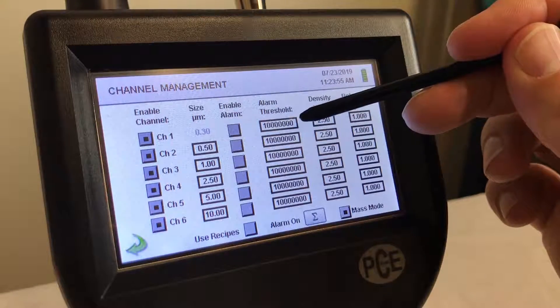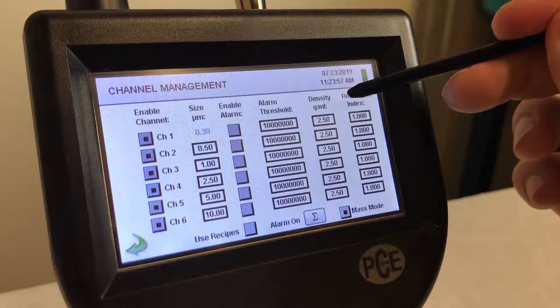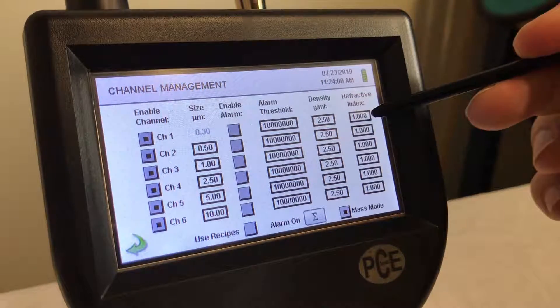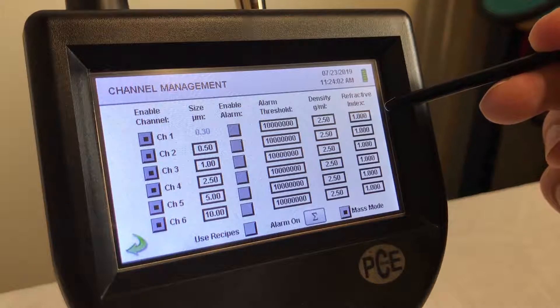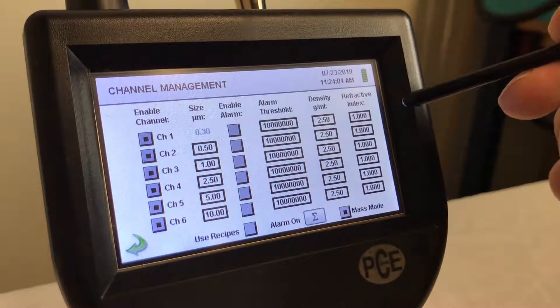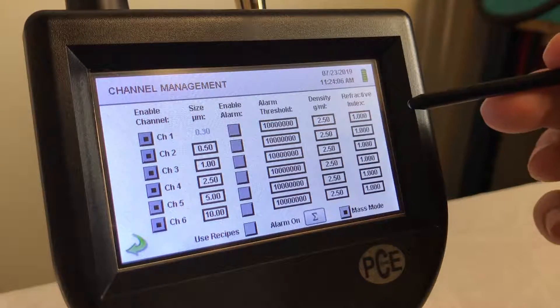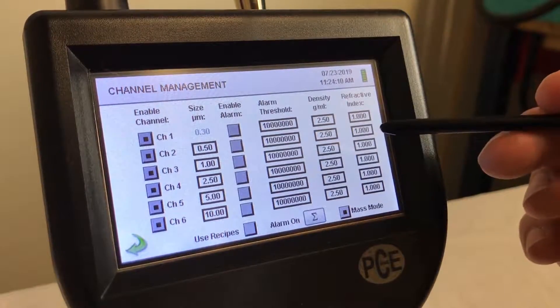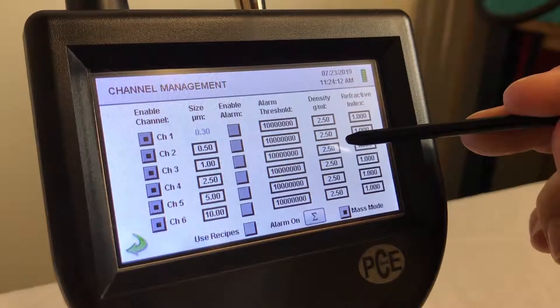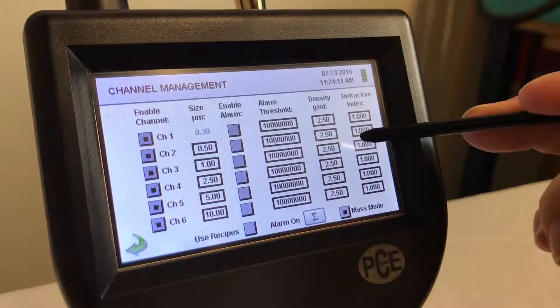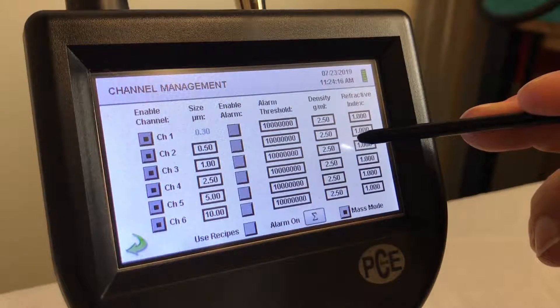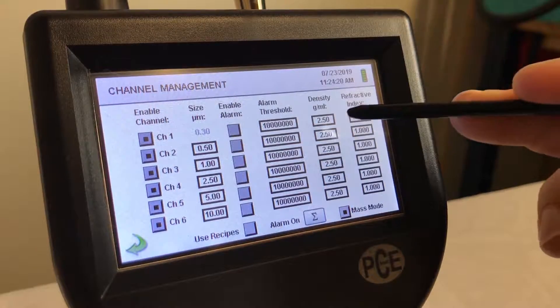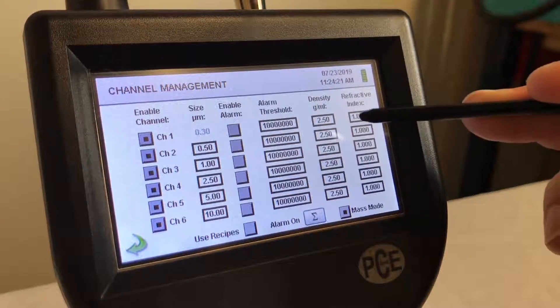Here's where you would set your alarm, and also your density and refractive index is set here. The reason you may want to change your density or refractive index is if, for example, you were looking for silica dust and you knew that the density is 4.0, then you could change that there. Otherwise, you just want to leave it as is.